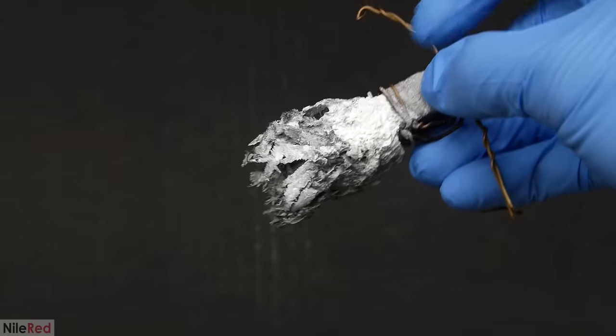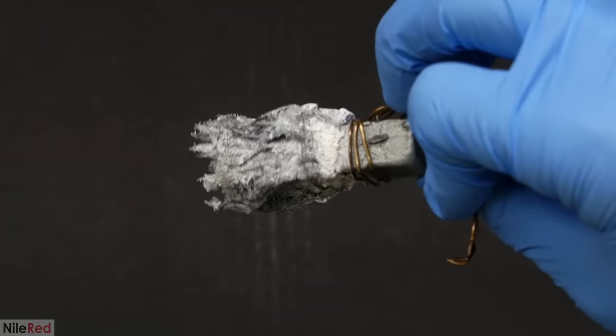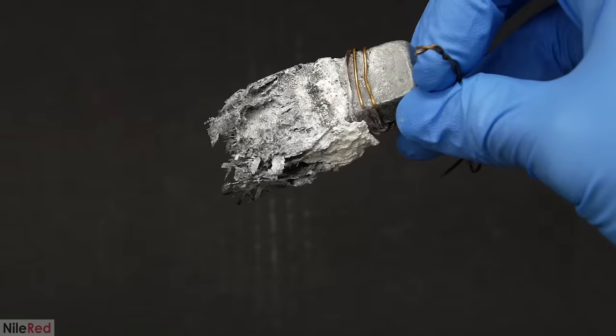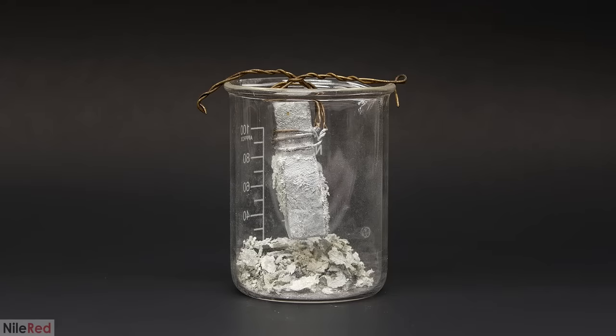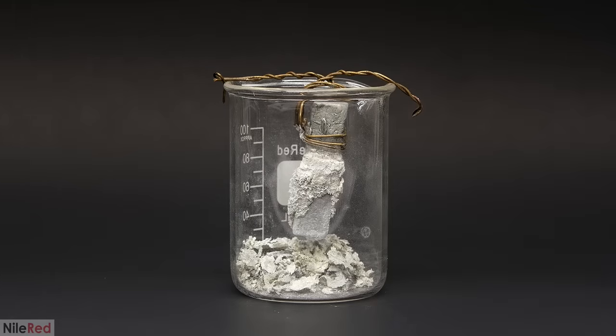The solution to both these problems might be to just keep it in the water. So I decided to repeat the experiment, and the first thing I needed to do was clean up the zinc. It took me a couple of weeks to finally get around to doing it, and by this time almost everything had turned white.